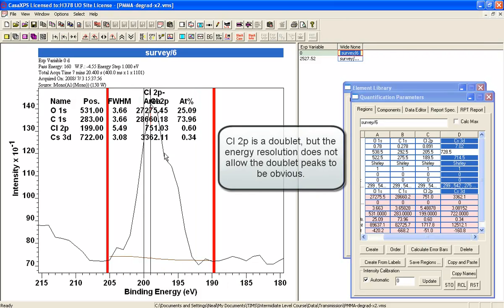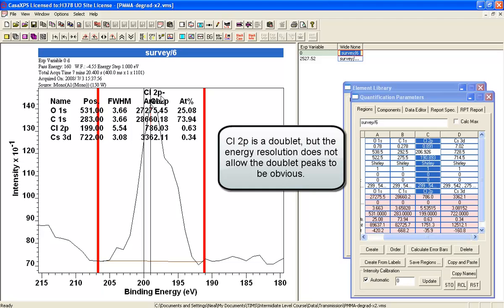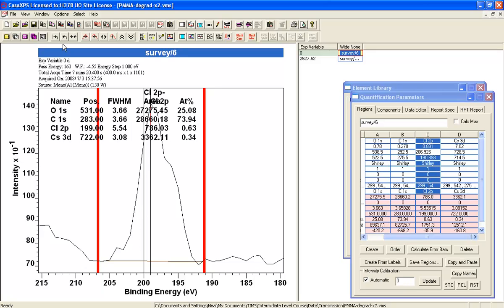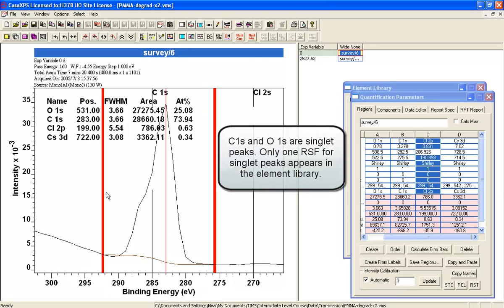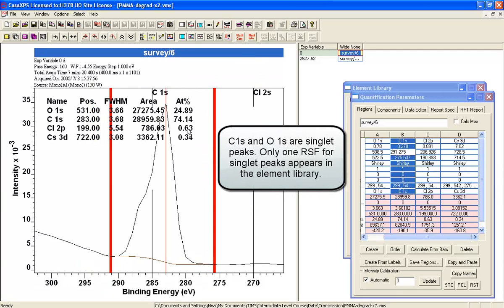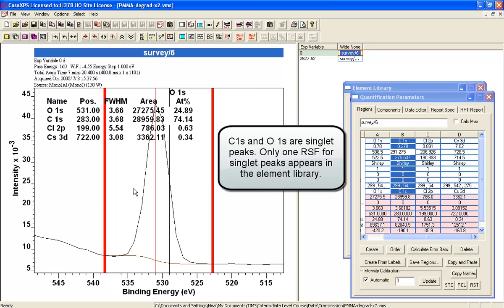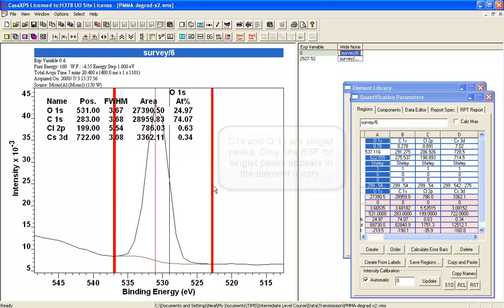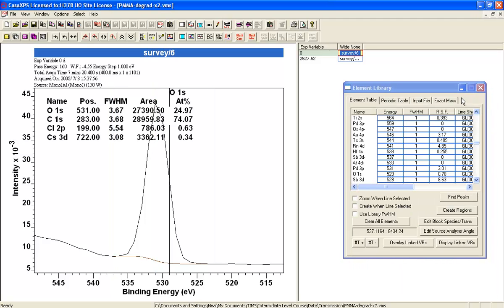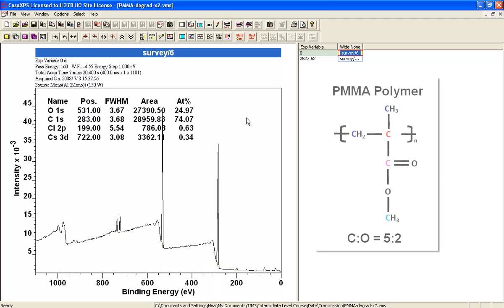The next one is chlorine 2P, which is both parts of the doublet, so we need the full RSF here. This is the carbon 1S and the oxygen 1S. Now we have the quantification information that we need to assess this.